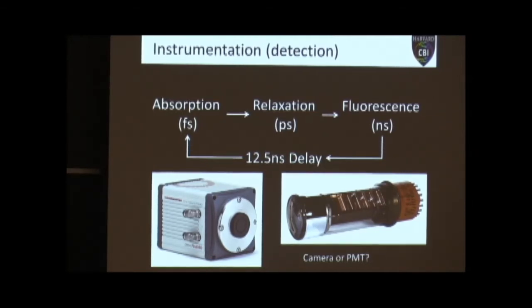Okay? So photomultiplier tubes, which we have on our confocals, we never usually associate that with being fast because it takes so long to take an image on a point scanning confocal. But over here, this is a parallelized detection. You're imaging all of the pixels all at once. With a photomultiplier tube, you're imaging each pixel one at a time.